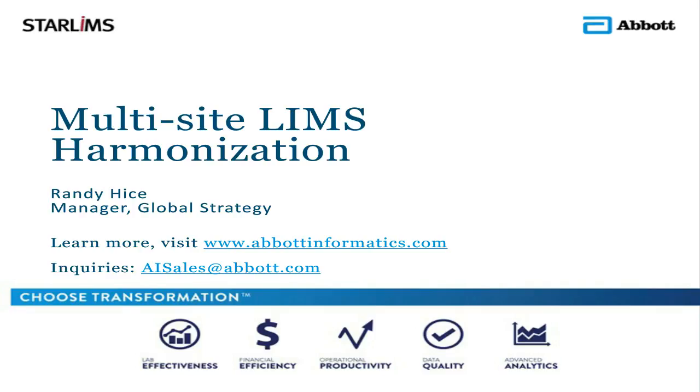And let's just say that they have 5 different laboratory groups that are participating in this sort of an exercise, and you're deploying the LIMS across 3 different sites. Well, it's going to be faster in a harmonized environment with a centrally served web browser access system because, remember, we're trying to consolidate the workflow at the design phase.